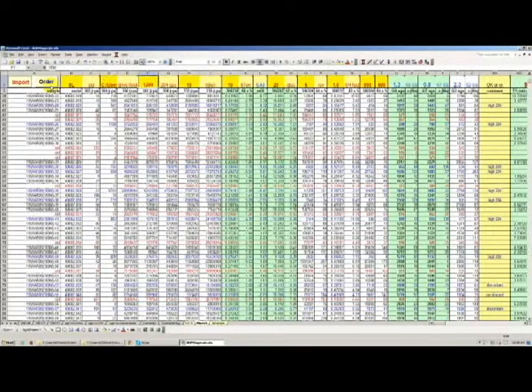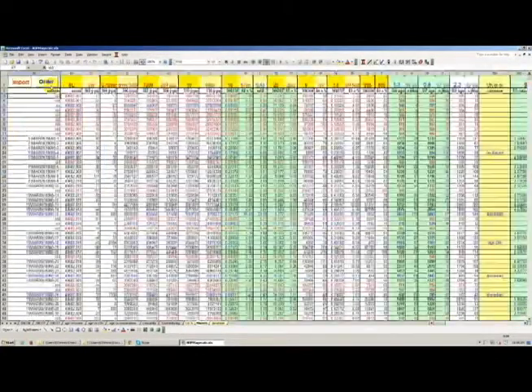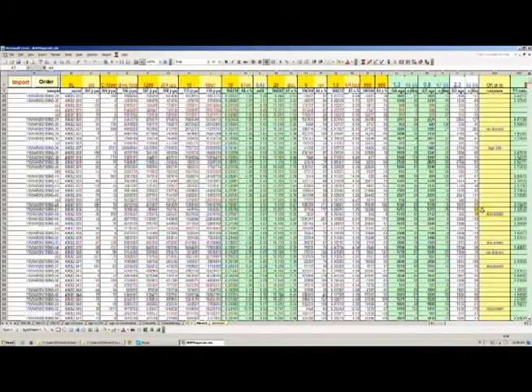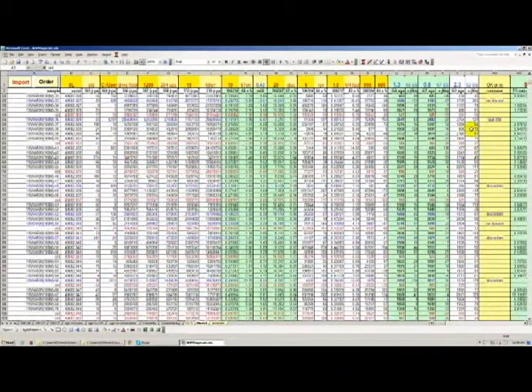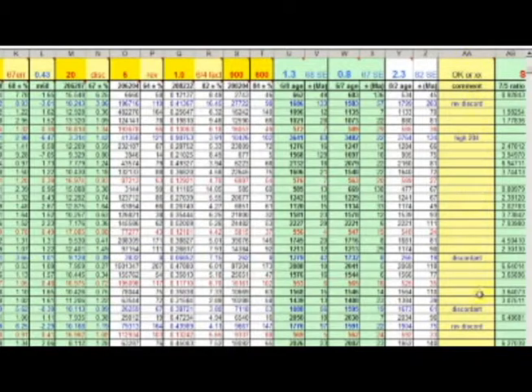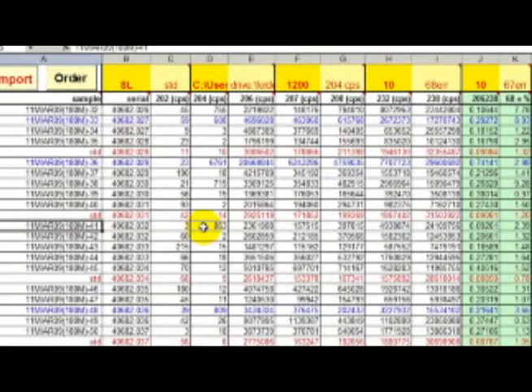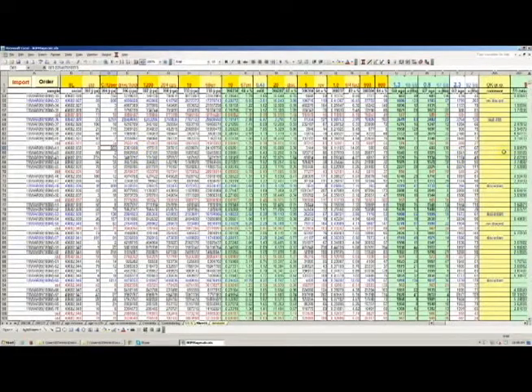So I'm going to go ahead and click order and scroll down again to that part that had a lot of high 204 grains, and you can see from column AA that a lot of those high 204s are gone. So now, for example, if you look at this grain, number 41, it was discarded before because it had a higher than 600 counts per second 204. It has 863, but now that one is being included because it doesn't violate any of the other filters.